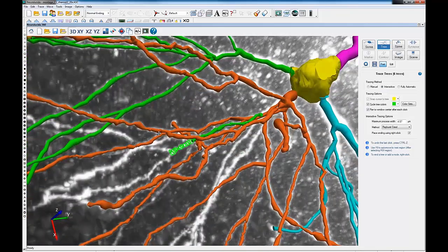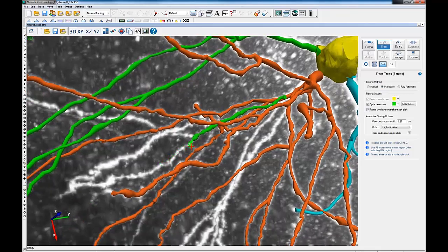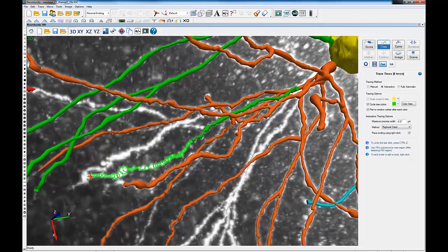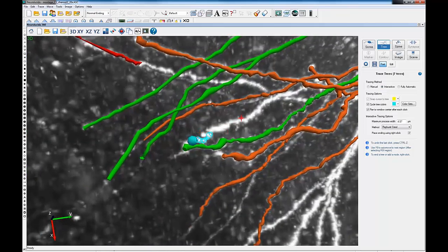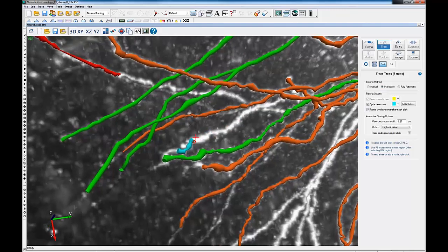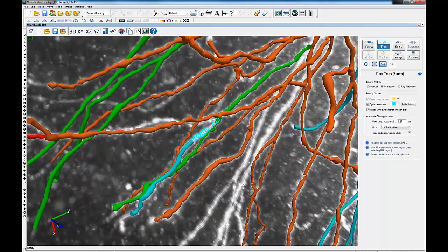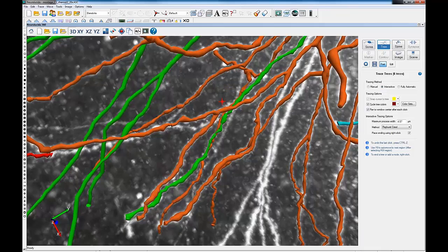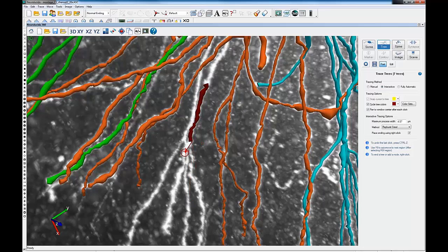If I'm injecting a monkey, I'll use a lower magnification because the cells are much bigger and I want to see the distal tips filling. So I can move to a 20x in that situation. Even then, it's hard to see all the distal tips filling. But it depends on the region you're looking at and what cells you're looking at, and it can change. What's important is that you really want to be able to see the cell body. If you're using DAPI as a guide, you can get an accurate injection of your tip into that cell, and you don't get too much leakage around your region.